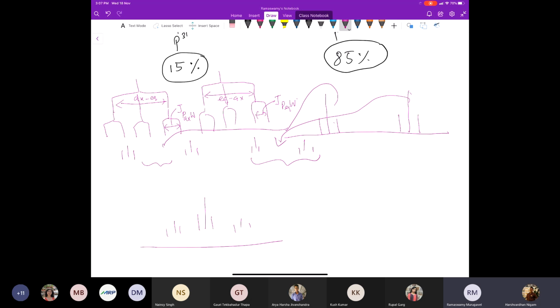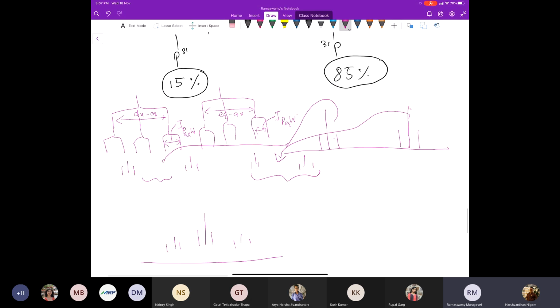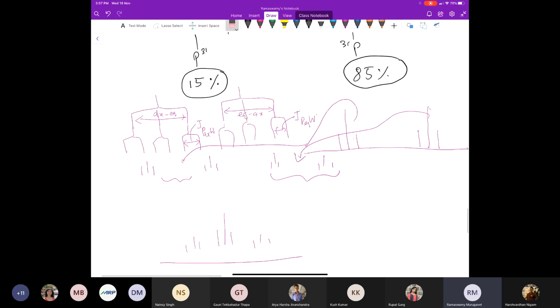Yes, sir. Thank you so much. This is really helpful. See, the 85% will give simply two triplets. Now tungsten coupling. So this is the main peak. I'm sorry, what is this? These two are the main peaks. These are the main peaks. Now these have to have satellites due to this.